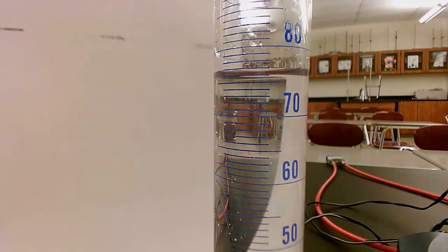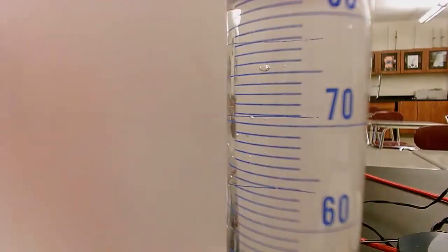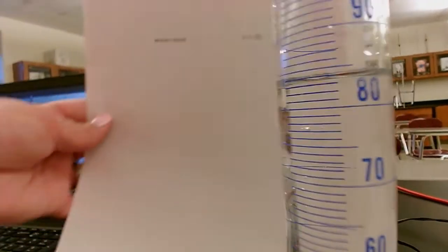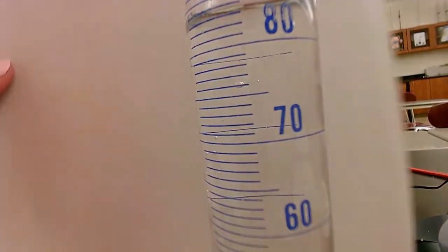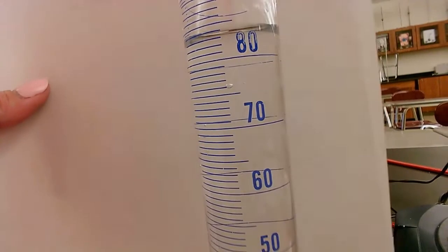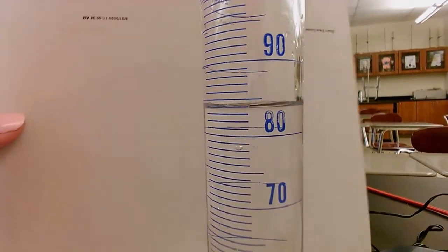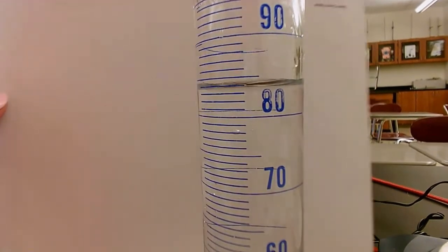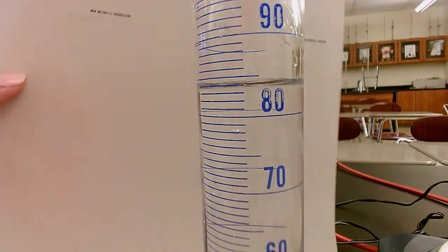All right, so now we're going to put the sample in, but we're going to tilt it because it's a little bit heavier. And now, there you go. That is the final volume. Wow, that's really nice once I figured out how to focus it.